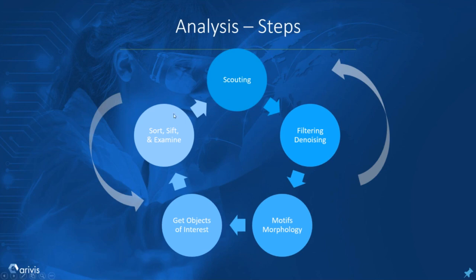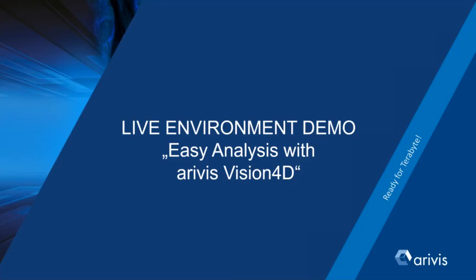And that means we're going to apply this cycle to a different portion of the image, and we may find some other regions where this fails. And so we want to cycle through again, and we want to build analysis pipelines that work not just for 1 or 2 or 3 regions, but we want to optimize so that we get the most reliable, high quality results from our images.